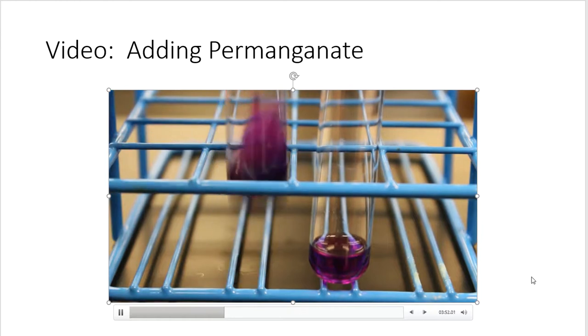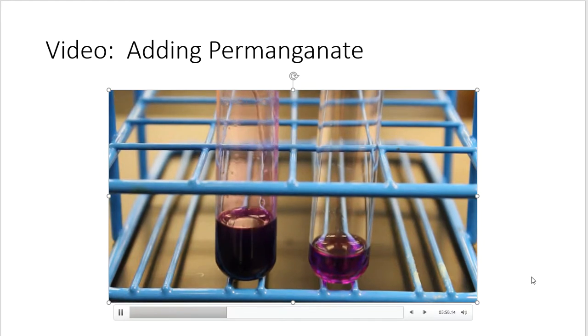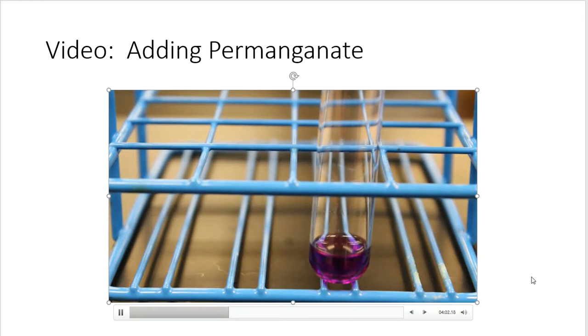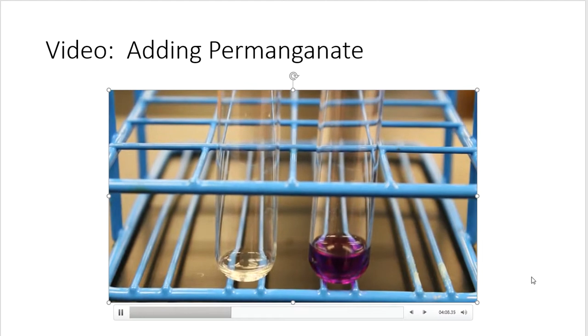All right, so I think that you could count the drops there on the screen, but I think it was very clear what it did within the first couple of drops. All right, so there's mineral oil. Our next one, canola oil. Let's see if this behaves any different.